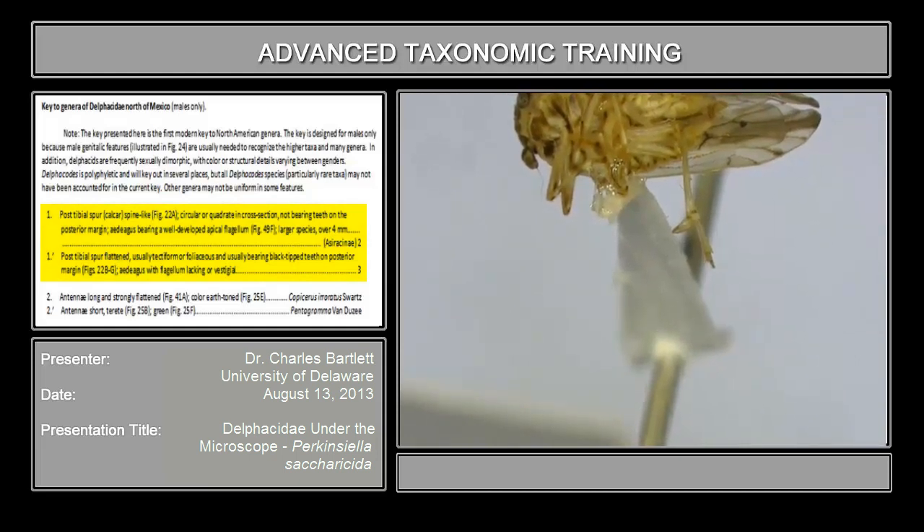What we have, if you are able to find the spur and reveal it — right here is the spur. It is flattened. There's a row of black-tipped teeth that is a little obscure because I've got to turn it just a little bit to see it more clearly. So this spur is not spine-like but rather flattened, and it also bears a row of teeth on the posterior margin. And that is what you're going to expect to see essentially all the time in interceptions. If you see anything else, then you have something interesting, or you've got one of a small number of taxa of Delphacini that, for whatever reason, lack those teeth.